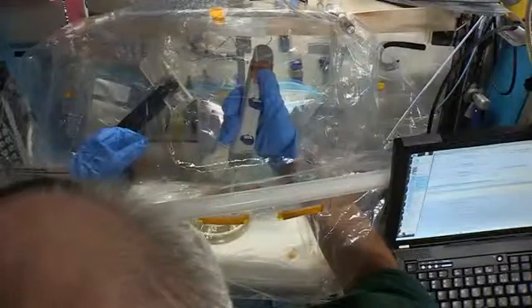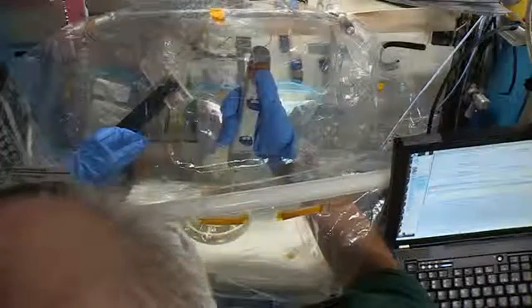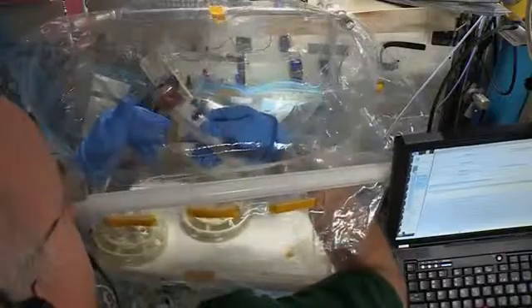And so clearly a very exciting new piece of technology. What is this going to unlock in the future for cell biologists looking to do their research on board the International Space Station? So again, there's a number of benefits that can come of this, and one of them is the first problem I told you about, which is time. Now researchers will get their information a lot earlier than they could have possibly done before. But it also allows us to start actually using the International Space Station as a lab rather than as what we like to call an exposure facility, where you used to have to package your organism. Up it goes, it gets exposed to microgravity, down it comes, and now you find out how it did. Instead of doing that, we're now not only exposing it, but we're also getting the information.